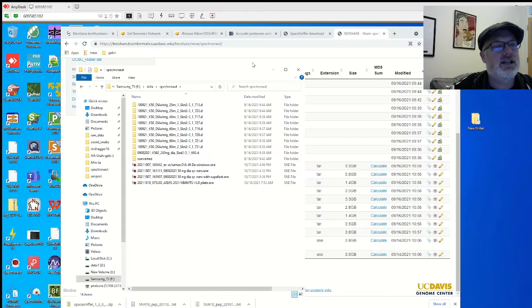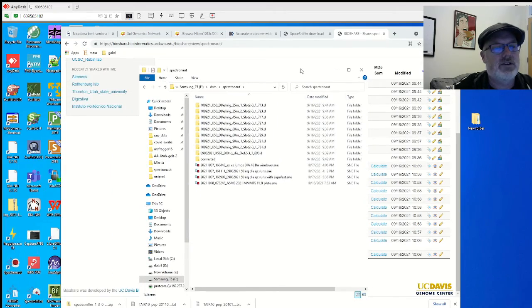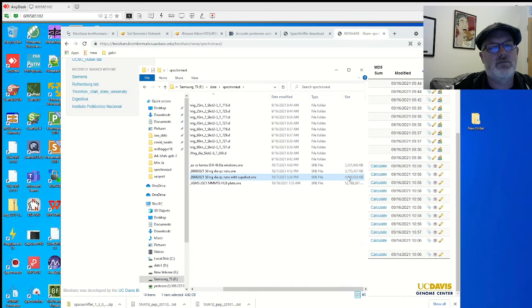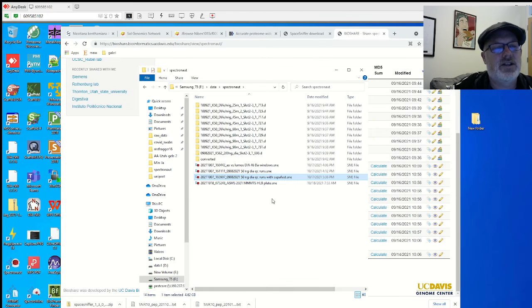So I think we're going to open this one. Actually, I think we're going to open this one, and I will put this on the BioShare. So actually look for this one, which is 4.8 gigabytes. No. Let's do that later. Let's do this one, the one we originally planned, the 50 nanogram QC. This is the one where we fixed some of the data. So we'll just double click on this.